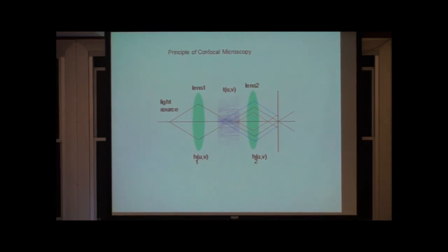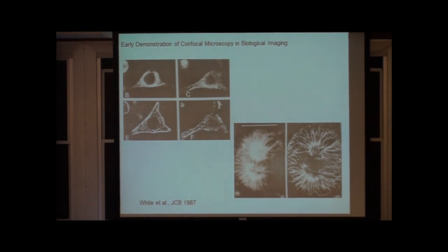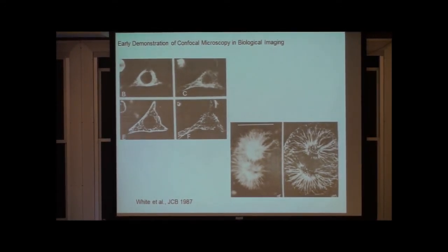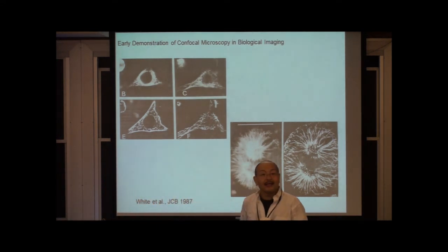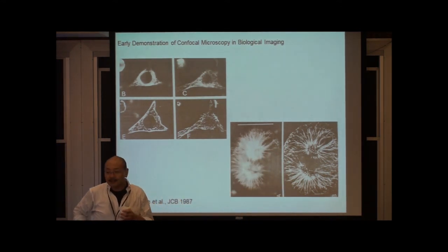In some way, the idea is very simple. If you look through the history of some of the imaging and spectroscopy methods, actually a number of people thought about that, but have not used it for imaging. So as I mentioned before, confocal microscopy was invented in the 1960s, and then it was forgotten until a number of things came around, including high sensitivity detectors, better scanning mechanisms, and most importantly, the development of computers.